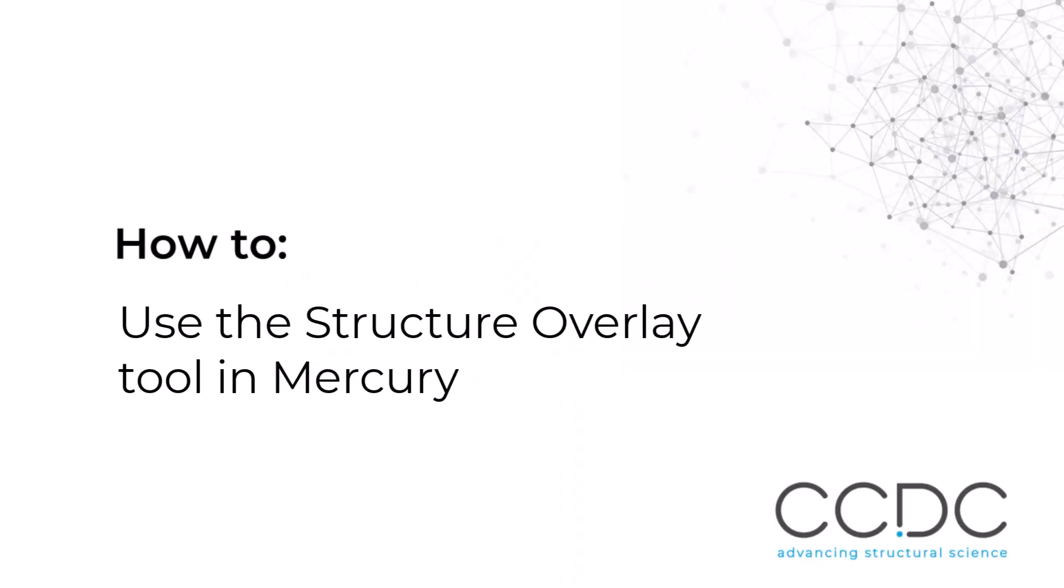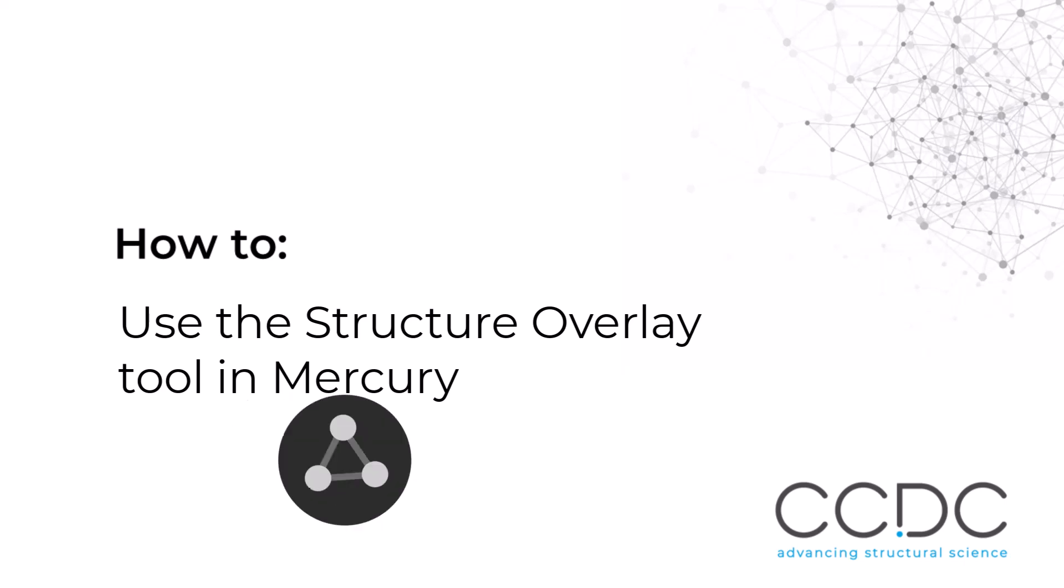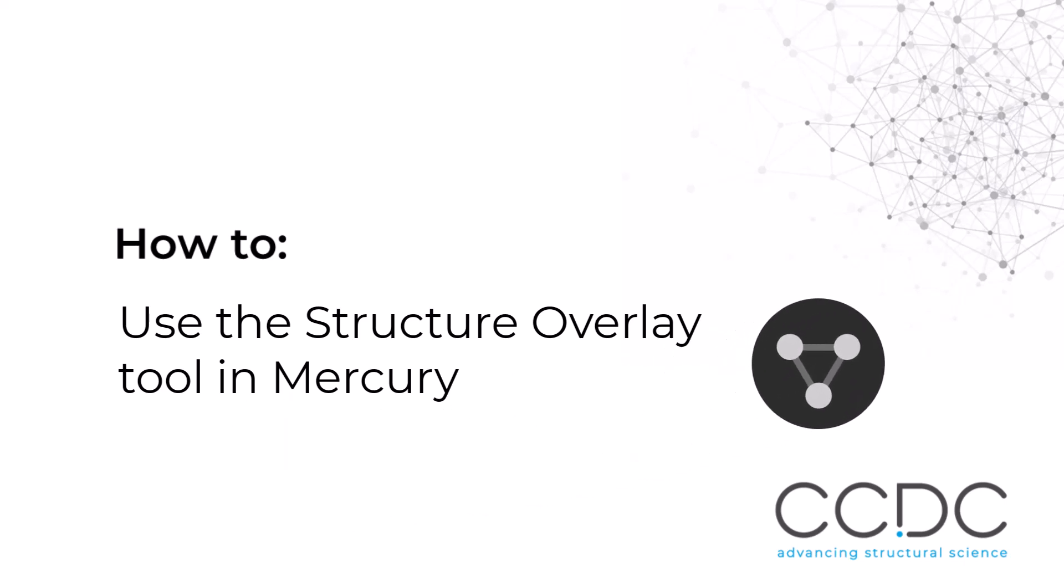Hi, I'm Andy Peel from the CCDC. Welcome to this video on how to use the structure overlay tool in Mercury. To begin, launch Mercury.